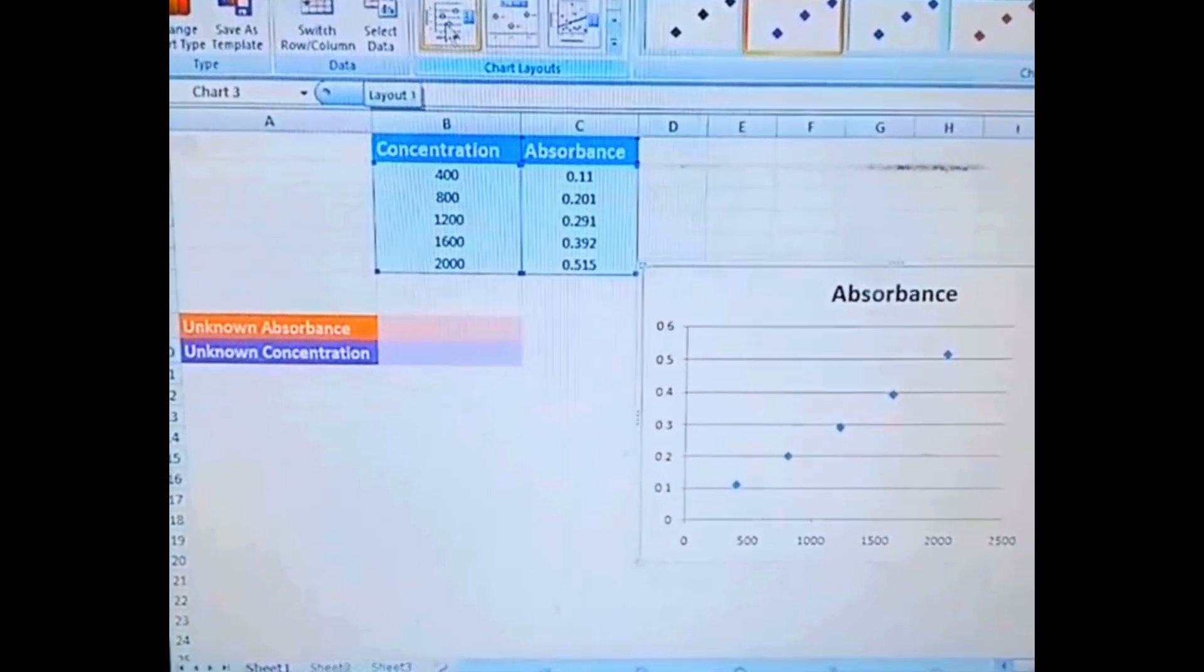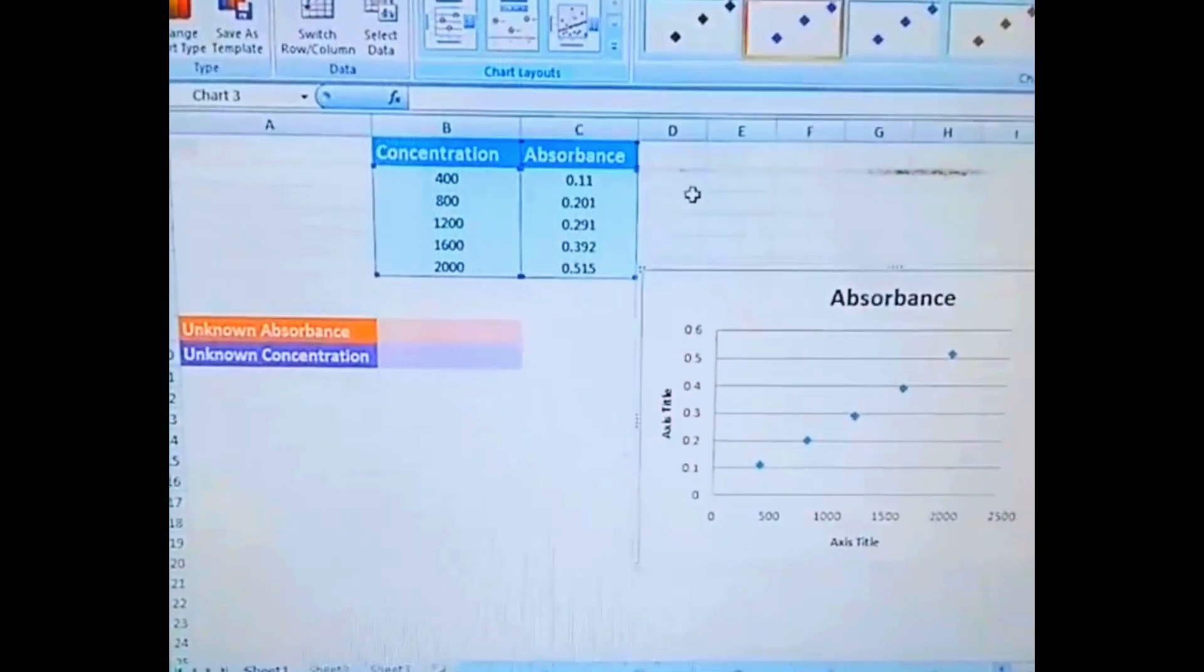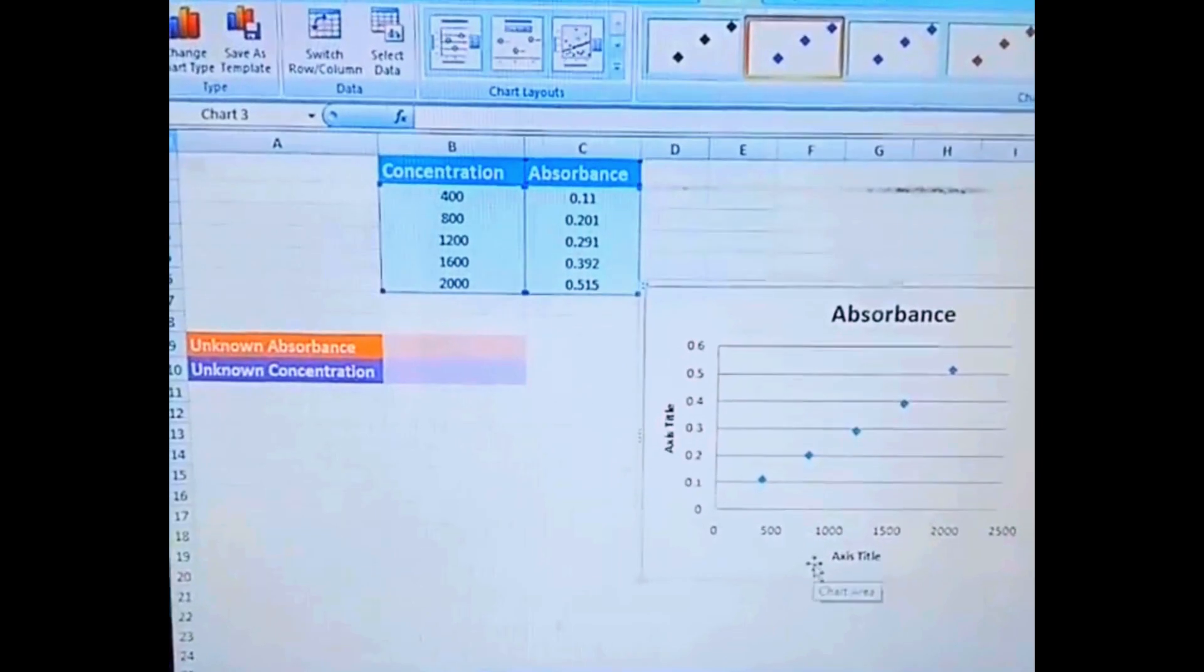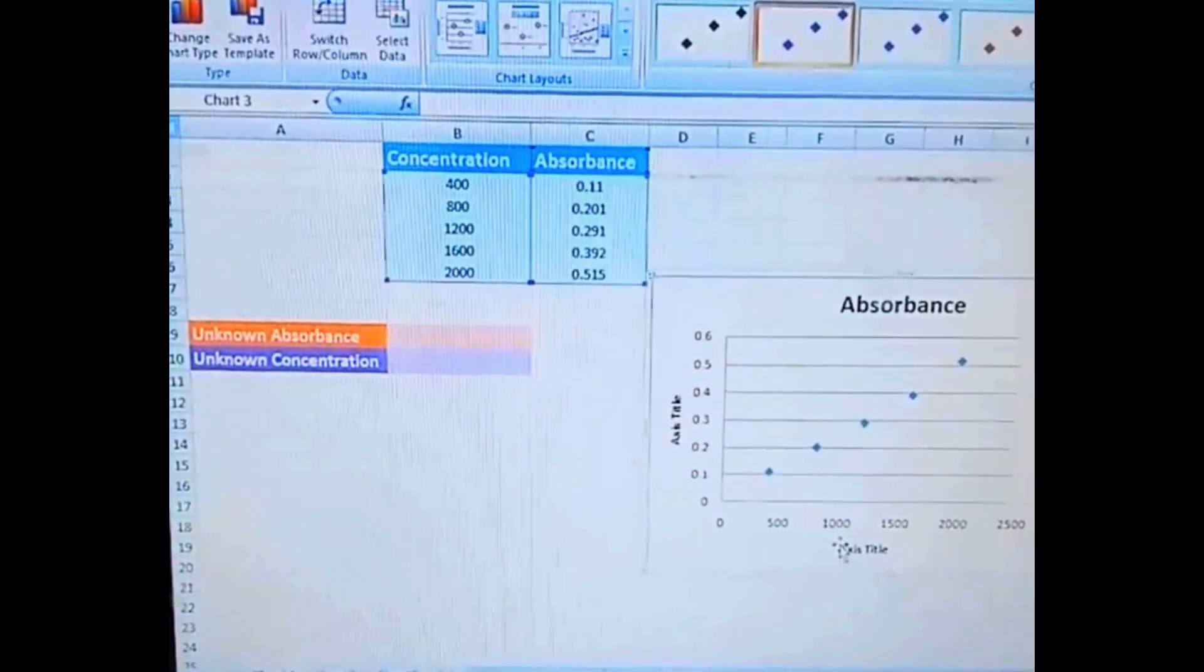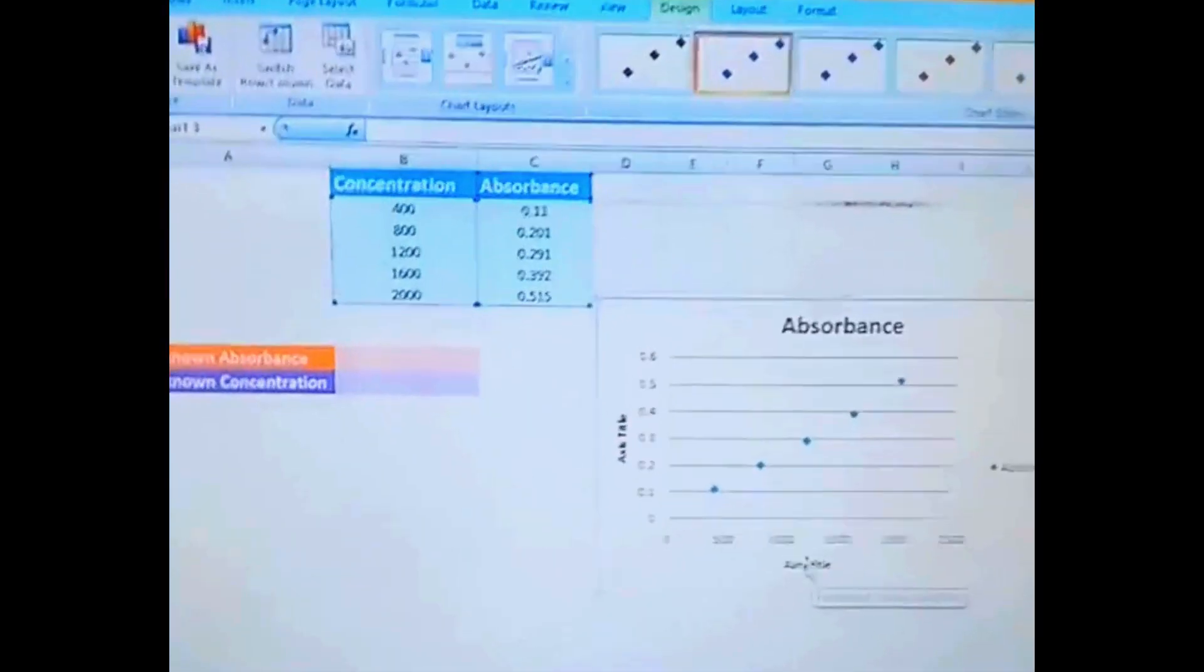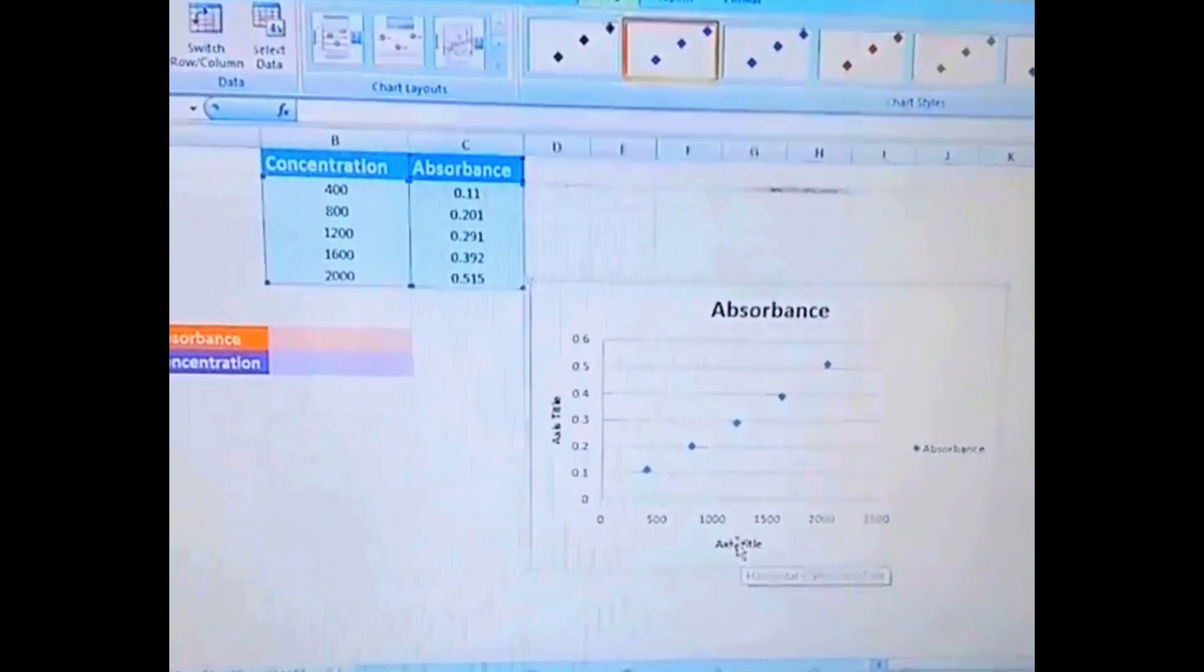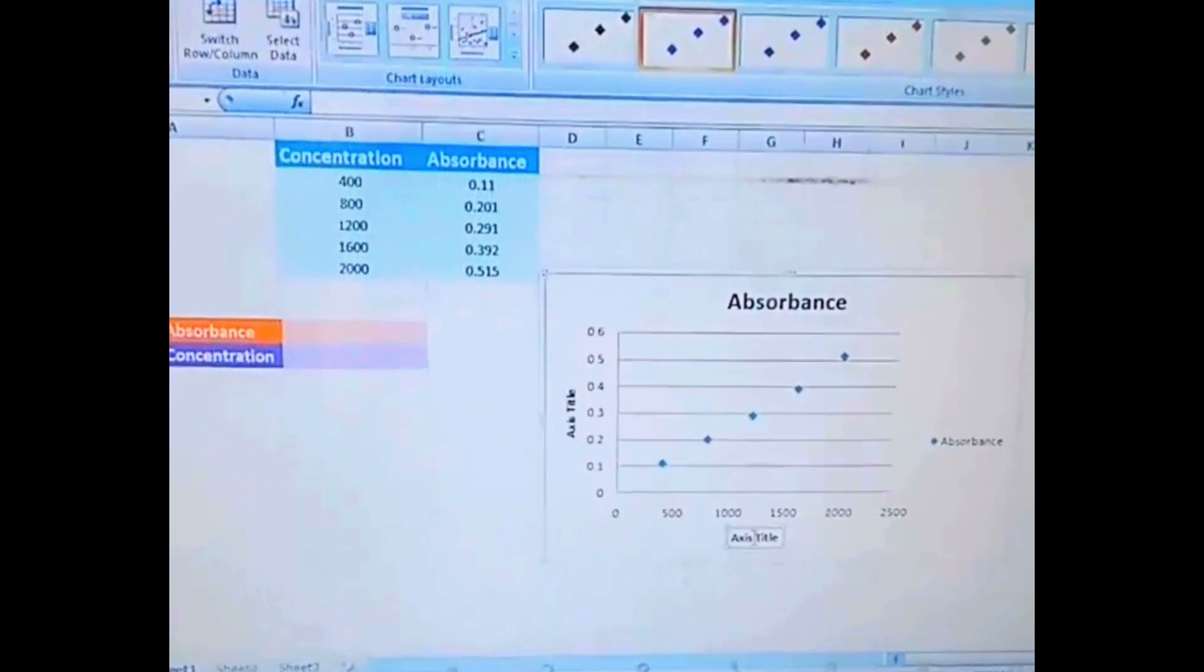Here we can see we have absorbance and here we have the X and Y axis. We know that on the X axis we always put the independent variable. So we can type here our independent variable, like we have the concentration.